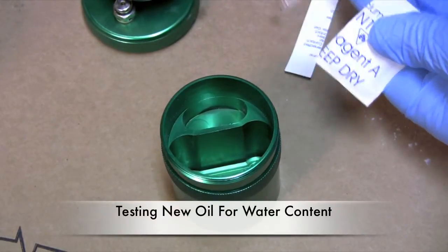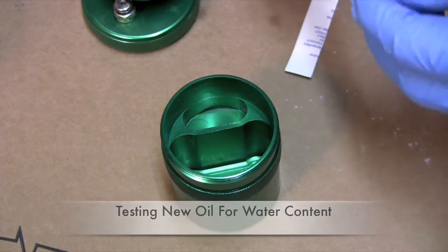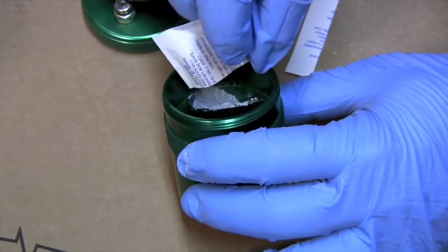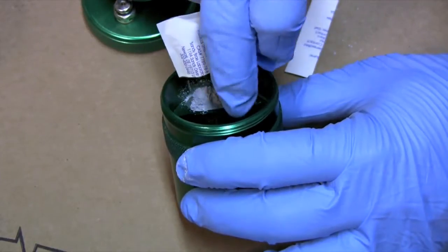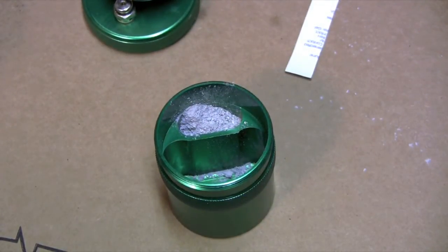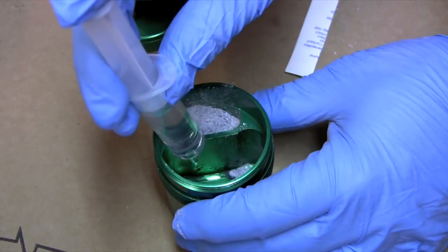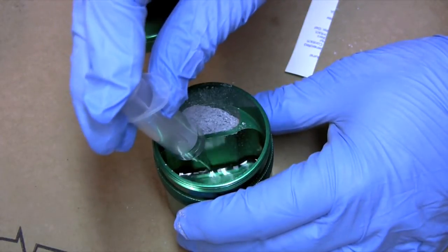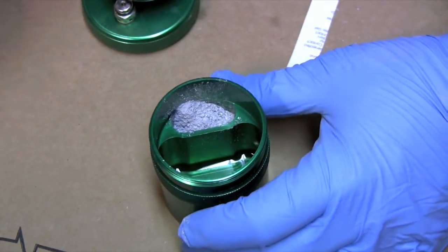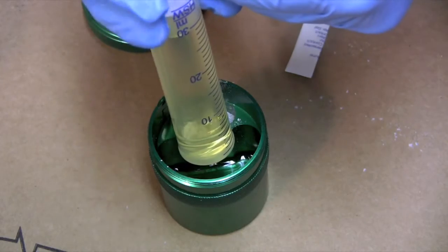First thing we're going to do is cut open our Reagent A packet and put it into the top portion of the kit, right in here. You want to try as best as you can to keep it all in that little vessel there. The next step is we're going to put our 10 milliliters of Reagent B down in here — this is a dry solution, just a dried solvent. And then we'll put 30 milliliters of our oil right into the vessel.